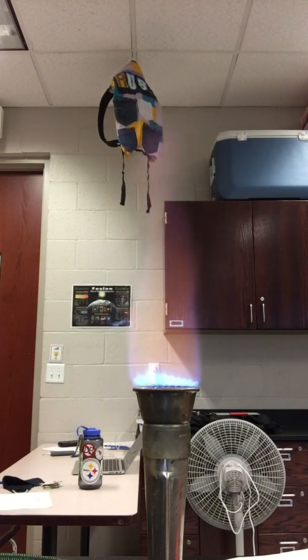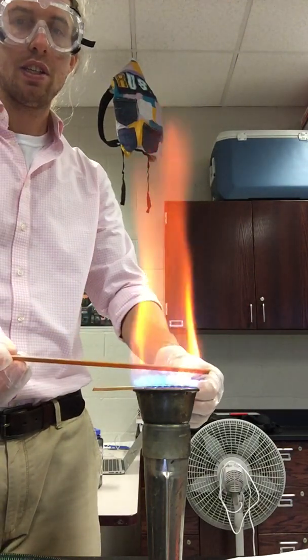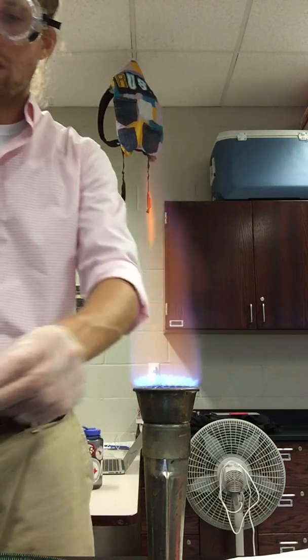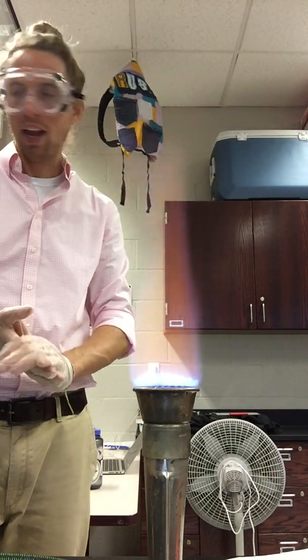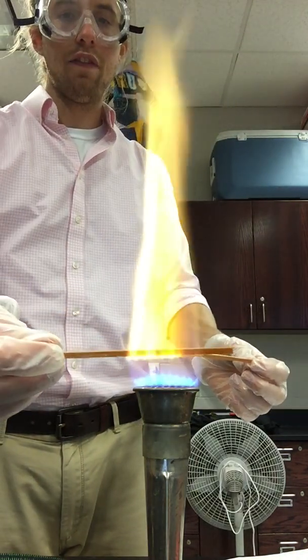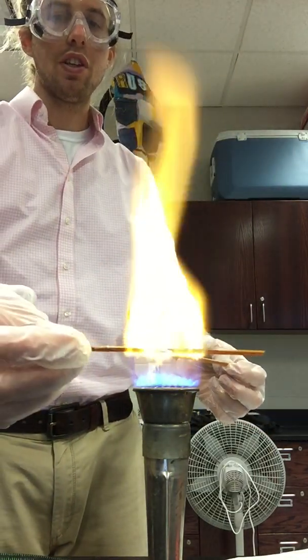So let's start off with number 2. Here's number 2. Here's number 6. You can see there's a difference there. 2, pretty red. 6, pretty orange. Let's also compare our yellows. Our 2 yellows were number 3 and number 5. So here's 3, and here's 5. Again, you're seeing more of an orangish goldenrod color in number 3 versus number 5 is more pale yellow.